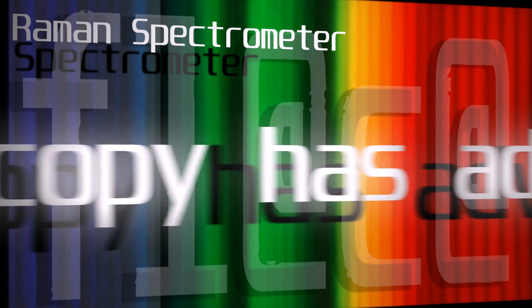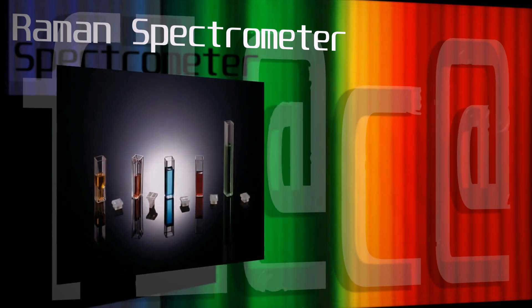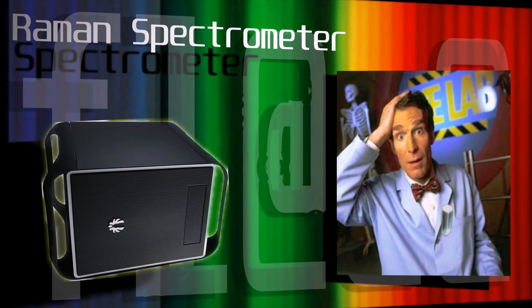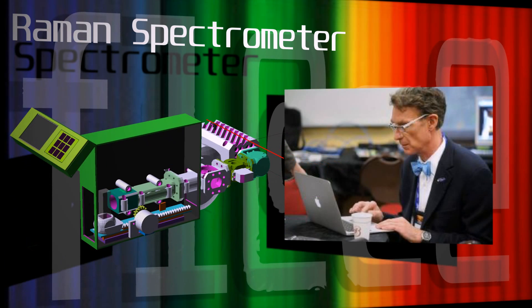Despite its weaknesses, Raman exhibits some major advantages. Raman can be used in aqueous solutions and there is no destruction of the sample. In my system, the user inserts a cuvette containing a sample into the spectrometer.